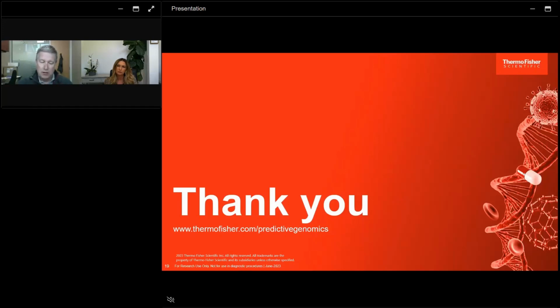We can run a large number of samples at one time. For example, for the Pharmacofocus I mentioned, that is on a 384 well plate, so you can analyze 384 samples at one time in a matter of a couple of days using that platform. So you can generate a lot of data very quickly that is specific for the question that you're answering. Next generation sequencing is fantastic for generating a vast amount of data. But the drawback to that is you have a vast amount of data. And so you have to store that, you have to analyze it, you have to extract it, and it's just not as practical in some cases.